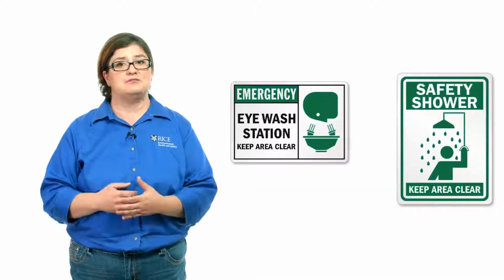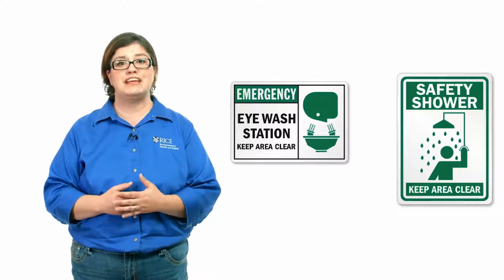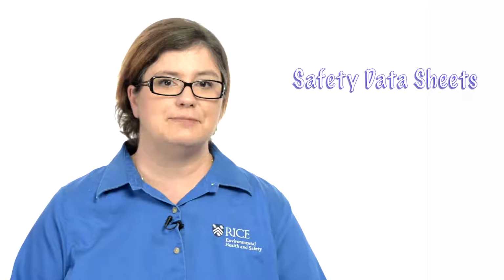You should notice signs around the laboratory where the emergency eye wash stations and safety showers are located. These areas should be kept clear, and you should be able to reach them in no more than 10 seconds if there is an emergency. I want to mention safety data sheets. Safety data sheets are informational sheets that exist for every material that you've purchased in the laboratory.